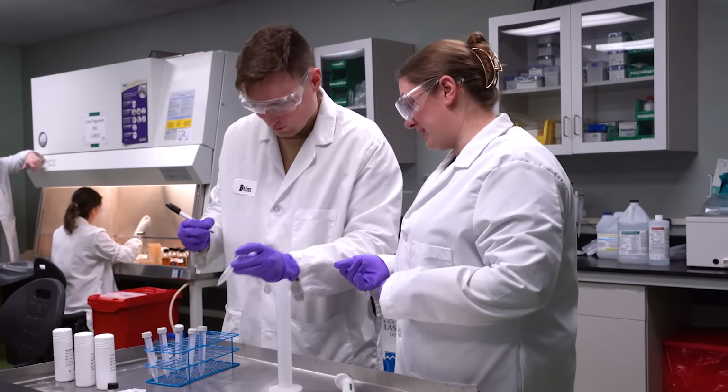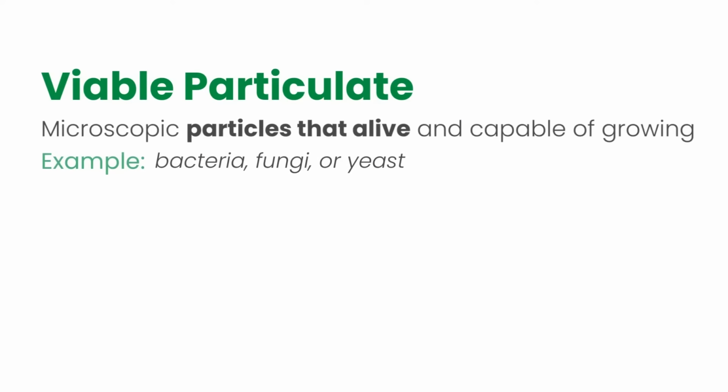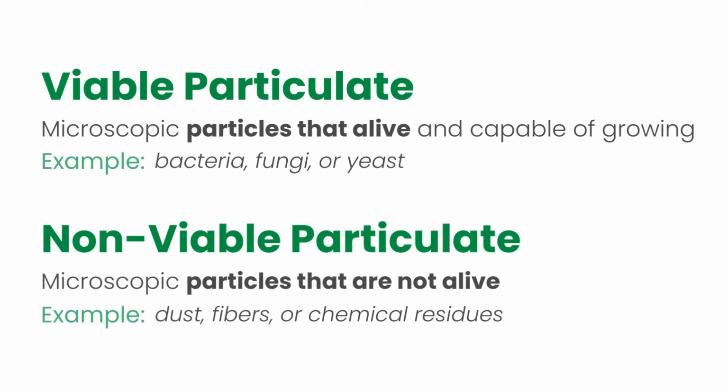The role of the microbiology group at BSM is really twofold. They ensure the environment and the water that we use in our manufacturing is suitable for use. This includes monitoring for viable and non-viable particulate. The microbiology group also does post-filling assessments of the isolators to ensure there's no microbiological recovery after filling operations.